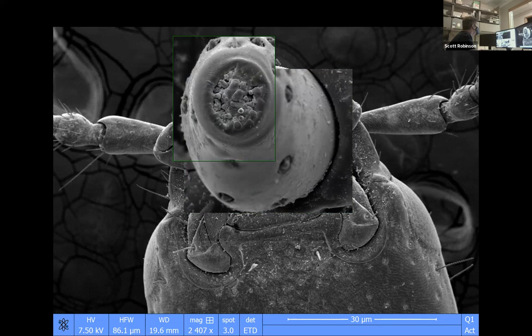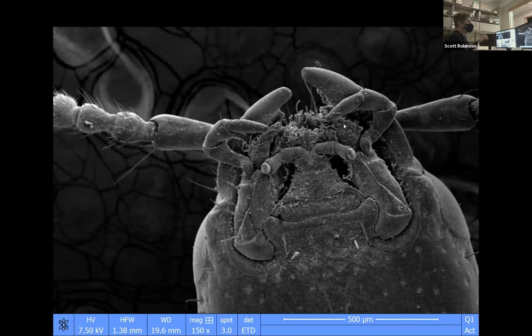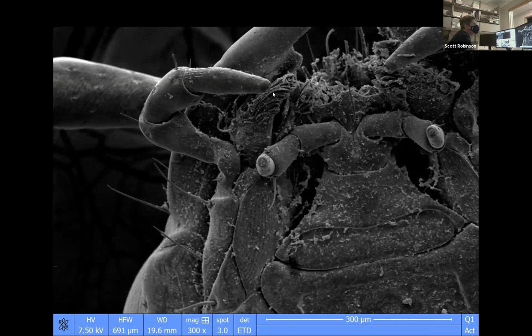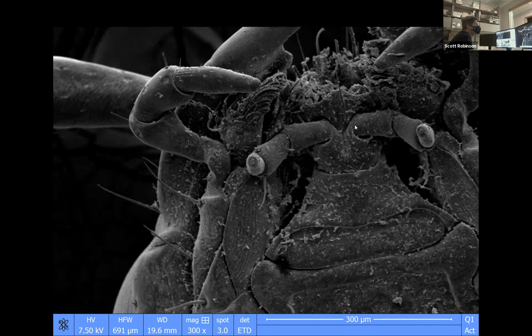What is this? I think it's a rove beetle. It's hard to tell. You can see the palps, the things that we had focused in on. You have mandibular palps, which I think is what this is. So the palps help taste the food and help manipulate the food. It might be a labial palp. Okay, so you have mandibular and labial palps, right? I don't know if there's maxillary and labial palps. It looks like the larger one's probably the maxillary palps, and the inner one, because it's coming off of that one singular structure on the outside of the mouth part, is probably the labium. Okay. So that's why we have an entomologist here.